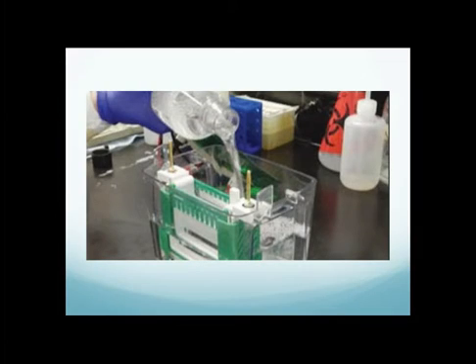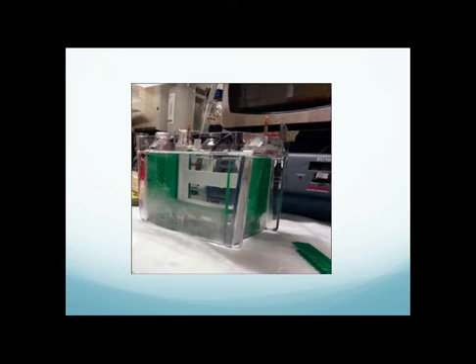Meanwhile, you're gonna pour the running buffer into the electrophoresis tank. Then, after the gel has solidified, take the comb out and put it into the gel tank. Then load the gel with the ladder and the protein samples. Run your gel until the samples reach the bottom of the gel.